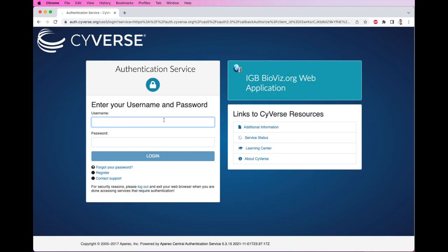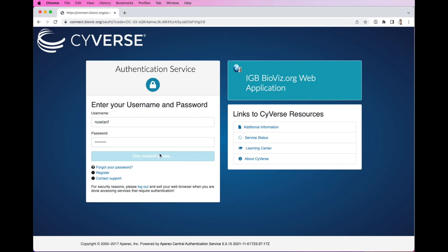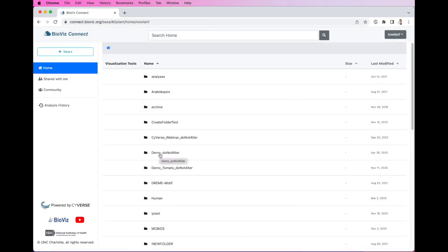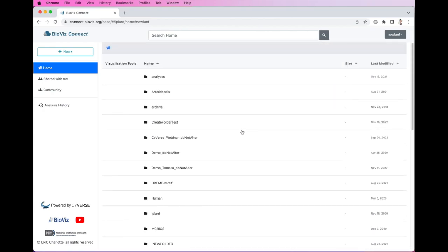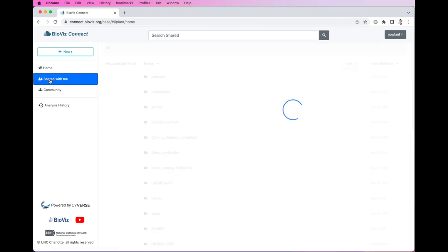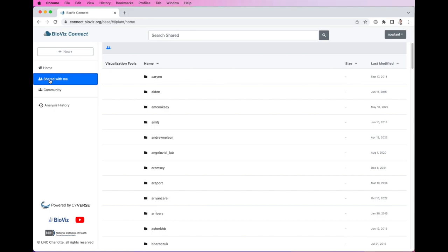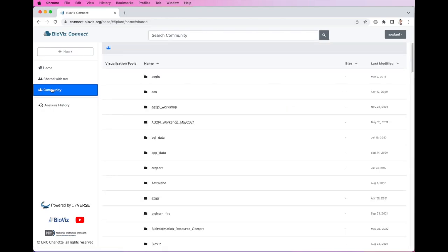I'll go ahead and enter my CyVerse username and password and click Log In. CyVerse will authenticate me and then direct me to BioViz Connect. BioViz Connect should look familiar to anyone who has used cloud storage providers such as Google Drive or Dropbox. My files and folders are visible here in the main panel. At the top, we have a search bar that can be used to find files or file types. On the left, we can navigate between our home folder, the shared folder, which contains all of the files and folders other users have shared with you, and the community folder, which contains files that are publicly available to everyone.